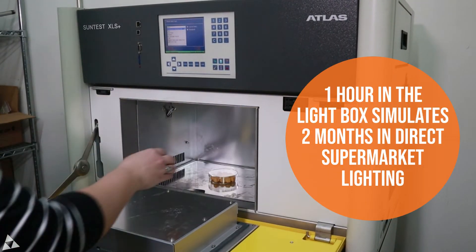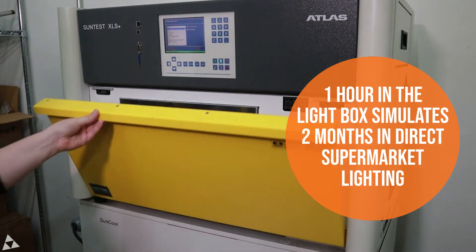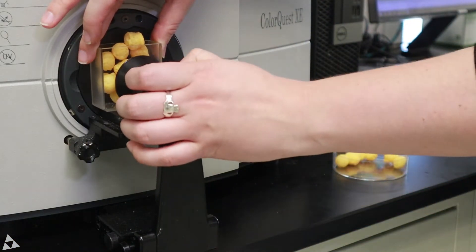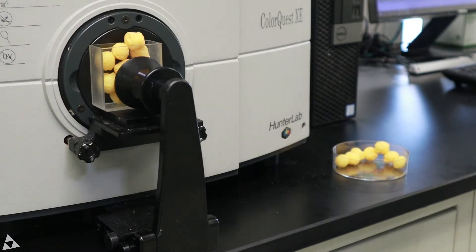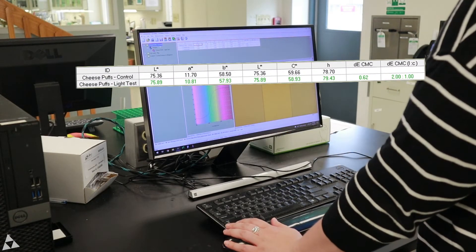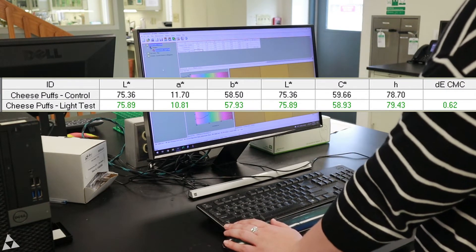One hour in this box is equal to two months in direct supermarket light. Once the light exposure is complete, the sample is removed from the light box and remeasured with the colorimeter to determine if the color has faded.